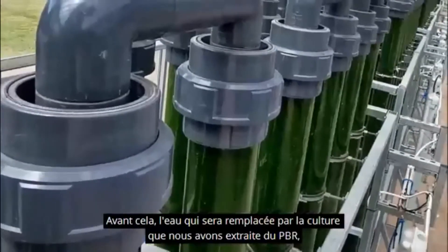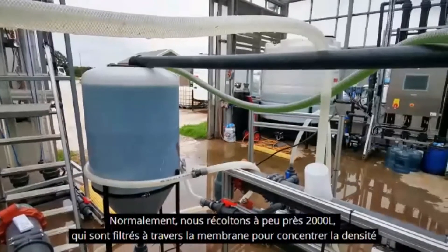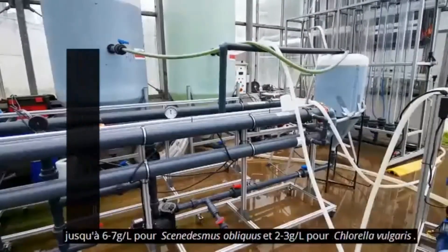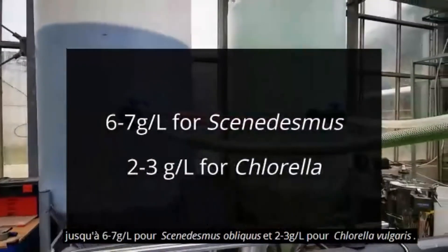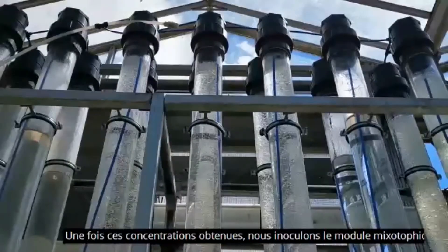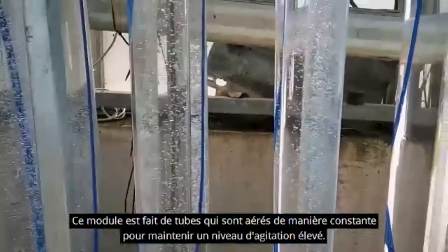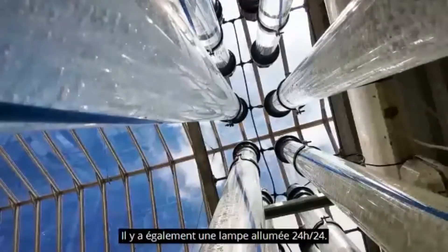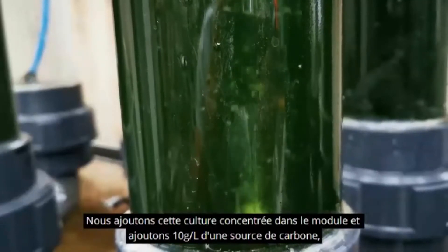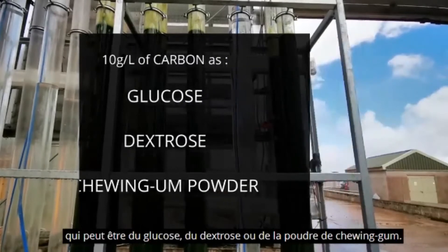Before harvesting, the water that will be replaced with the culture extracted from the PBR must be filtered to equalize the levels. Normally we make a harvest of about 2000 litres, which is passed through the membrane to concentrate the density up to about 6-7 grams per litre in the case of Scenedesmus, and 2-3 grams per litre in the case of Chlorella. When we obtain these concentrations, we proceed to inoculate the mixotrophic module. The module consists of tubes that are constantly aerated to maintain a high agitation level. There is also artificial light on 24 hours. We add the concentrated culture into this module, then 10 grams per litre of the selected carbon source, which can be glucose, dextrose, or chewing gum powder.